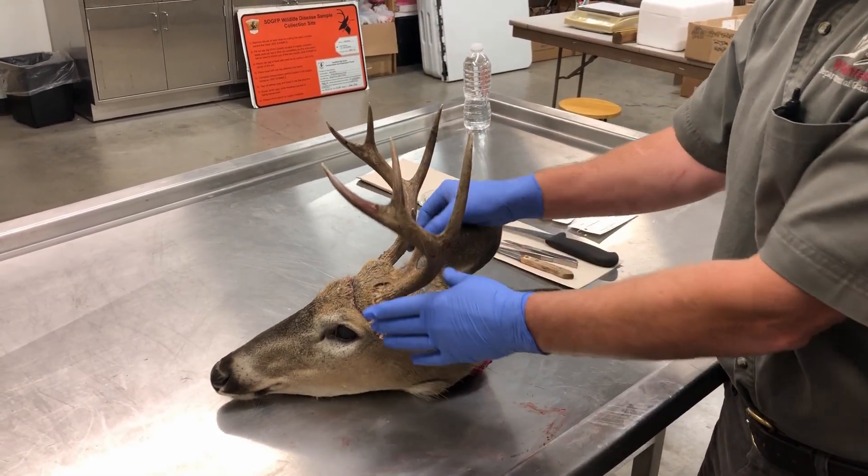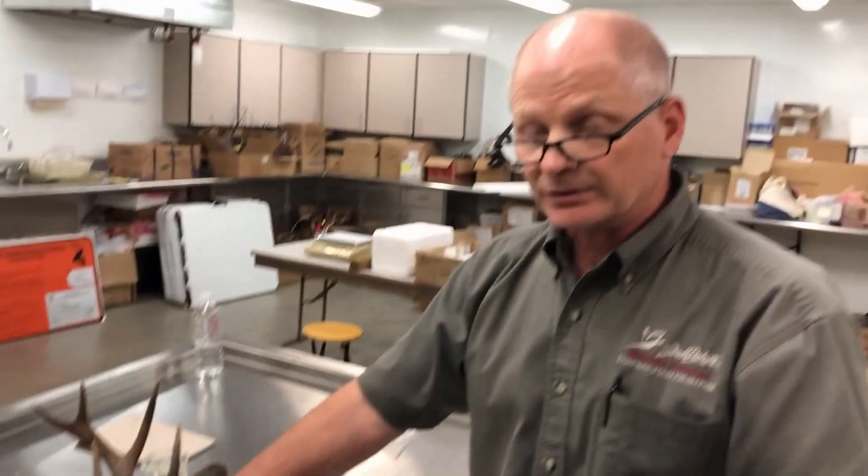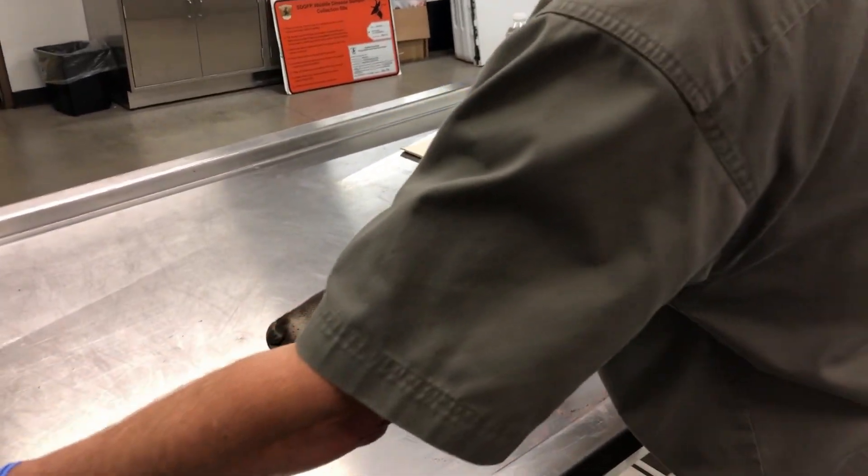If a hunter wanted to leave the head on there for a European trophy mount, you would just leave the antlers on there and pull the sample and you won't affect him. If it's going to be a mounted animal — deer and or elk — we're going to need that hunter to have caped this animal off before they bring it in. In that case, the taxidermist will have already taken the antlers off. So we'll remove these antlers out of our way.